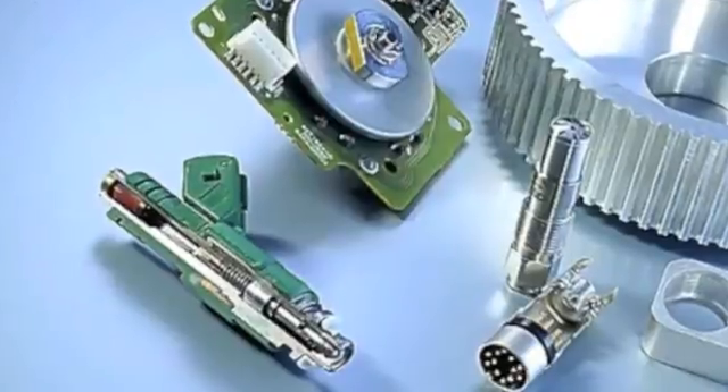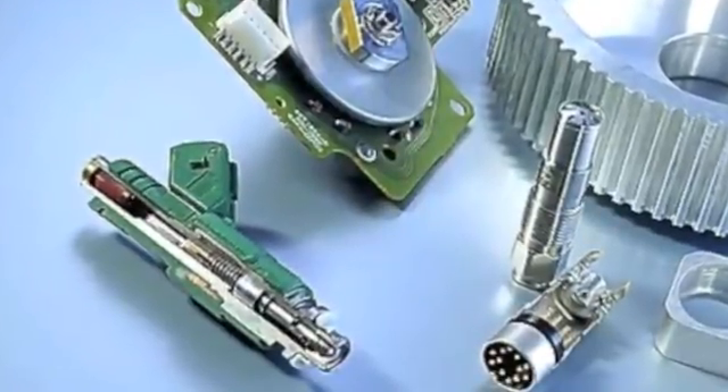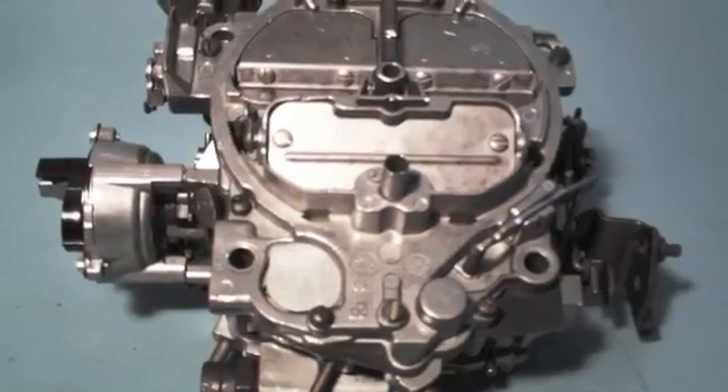For example, when you're cleaning precision parts or surgical instruments. It's not as important when the cleaning doesn't have to be so perfect, like when you're cleaning carburetors just to remove grease.